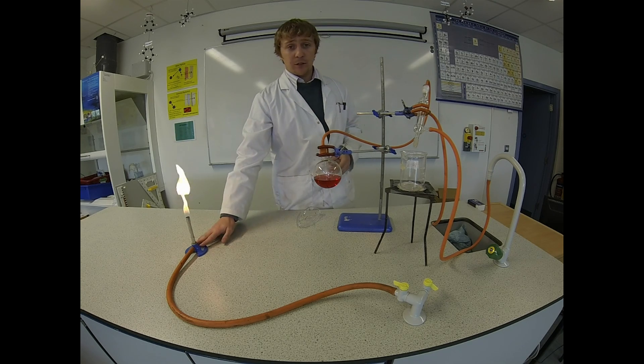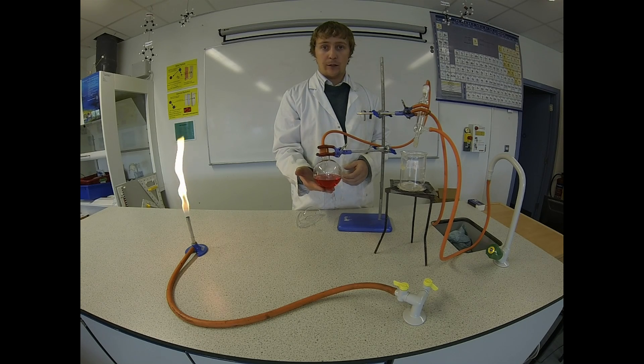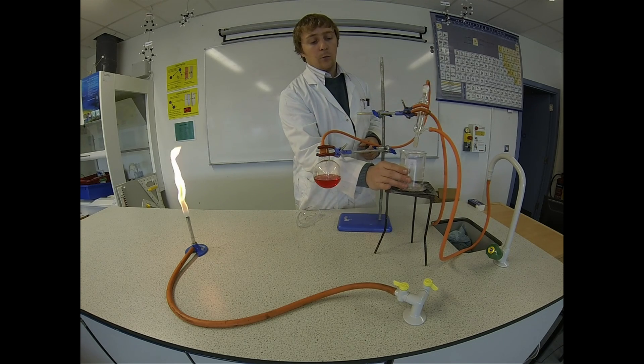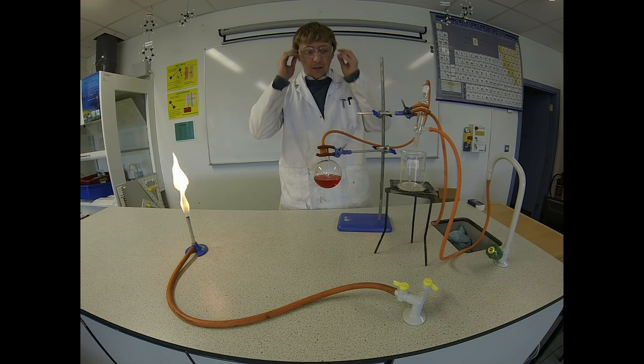For this experiment you're going to need a Bunsen burner, a round bottom flask with your mixture in it — you have salt water in here. I put a bit of red food dye in there just to make it clearer to see. You also need a retort stand, a Leibig condenser, and a beaker here to collect your water. Make sure you have goggles on because you need your eyes to see the results.